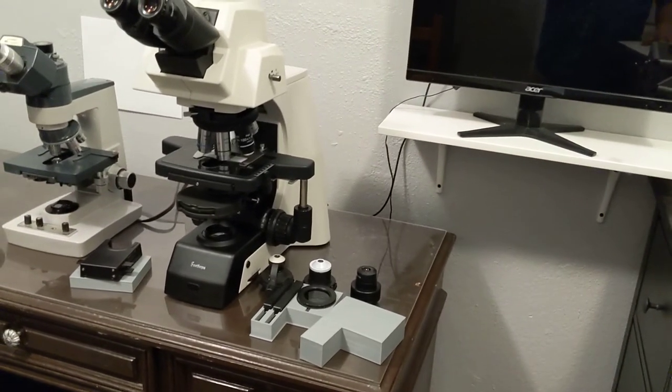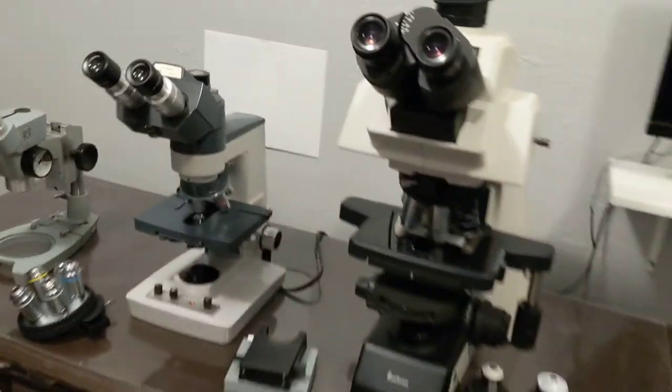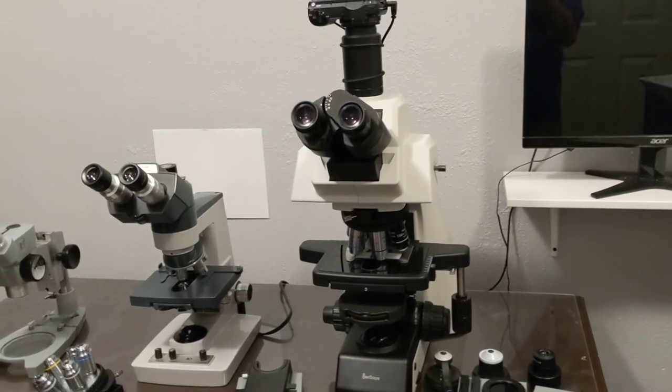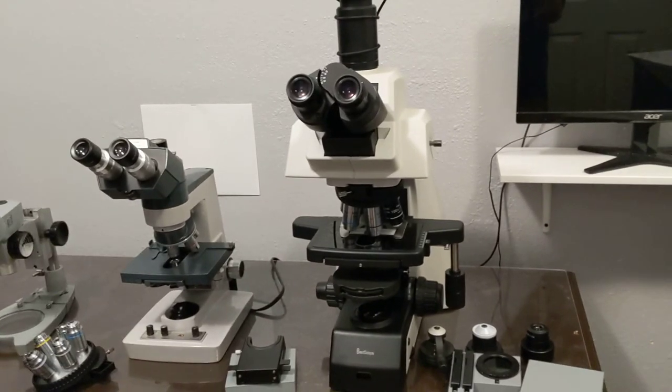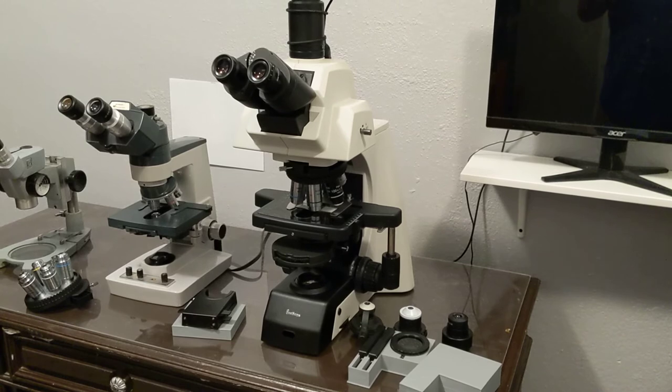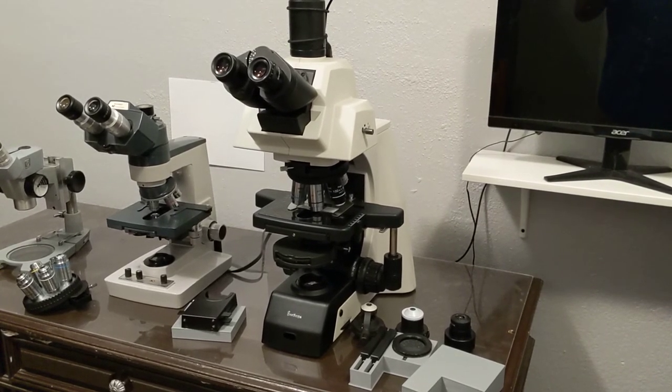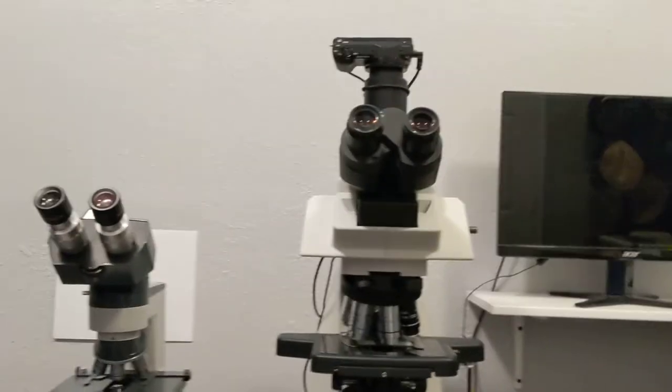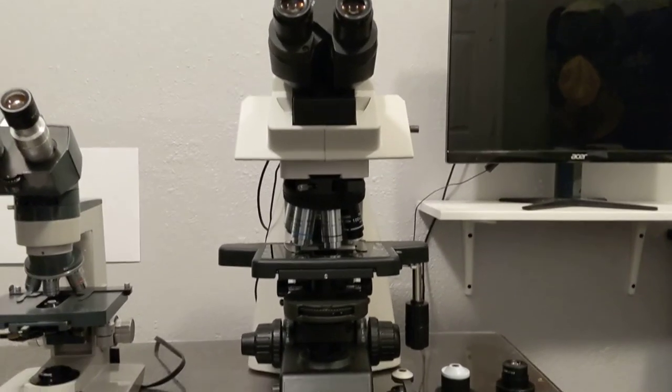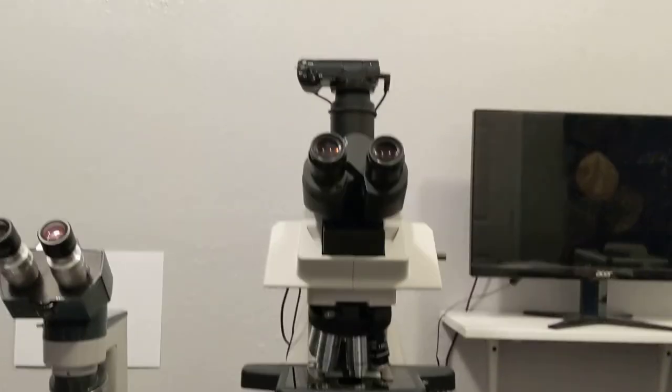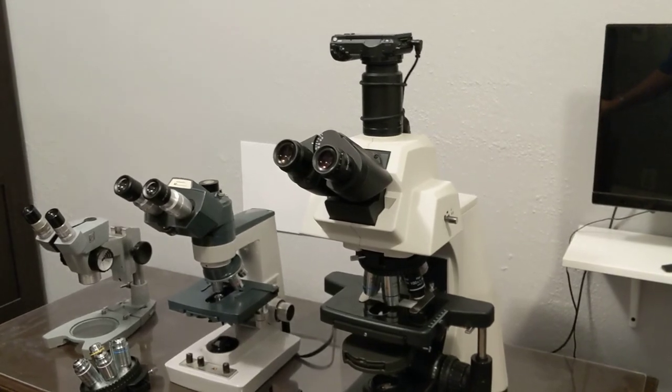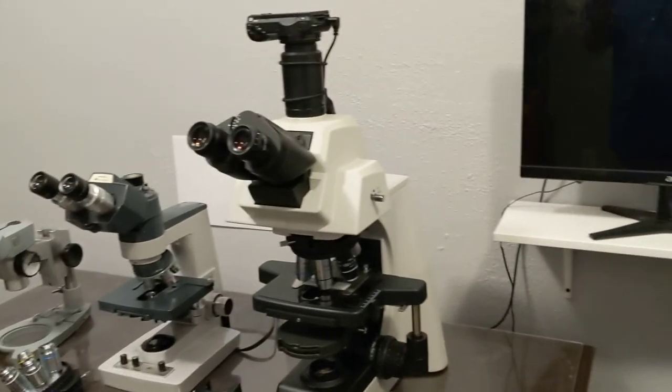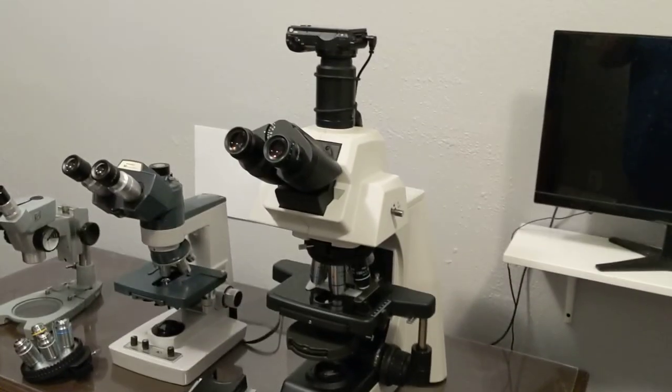I want to sum up complaints that I have. I understand why they did it. It's very convenient for them to just have a slider. But I would prefer it if they had a rotating intermediate neck piece. Nikon does make something like that, and because this head is compatible, I might be able to buy it. All my complaints are so minor. The stage has some kind of flex, but not a lot. The DIC condenser came with this prohibition against using the iris, but it was fixed. Overall, I'm extremely happy with it. Any questions that you have that I might be able to answer, I'm happy to fill you in.